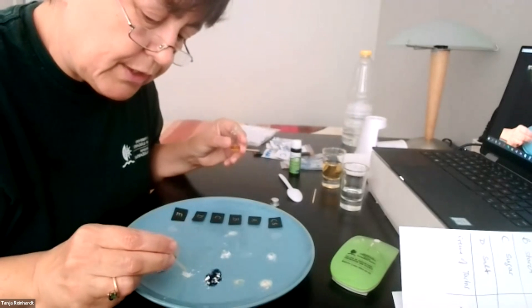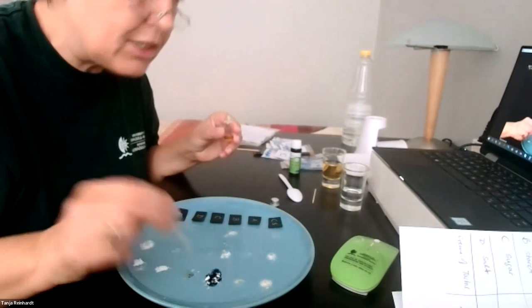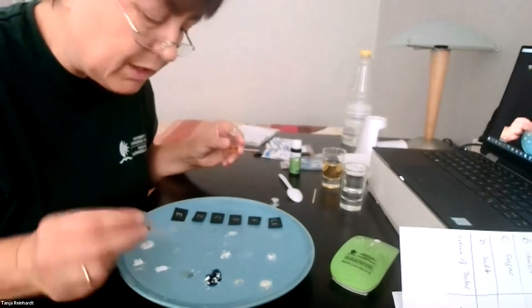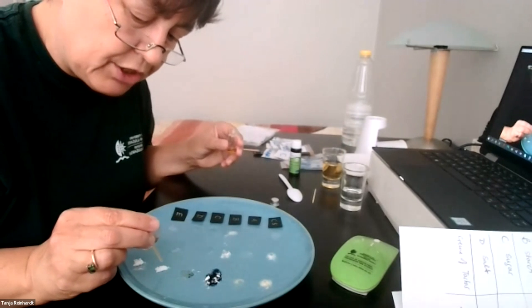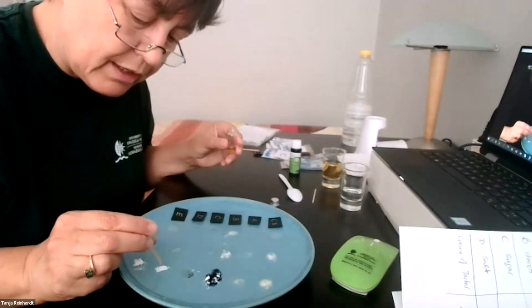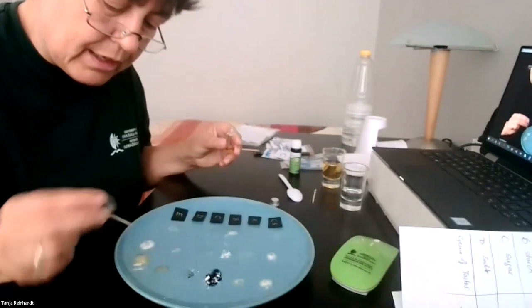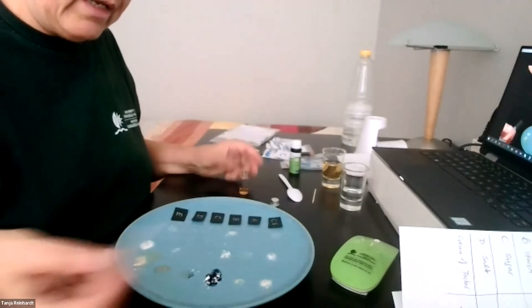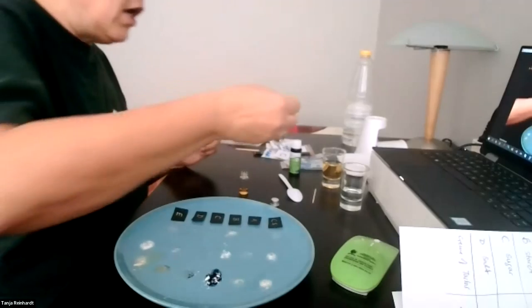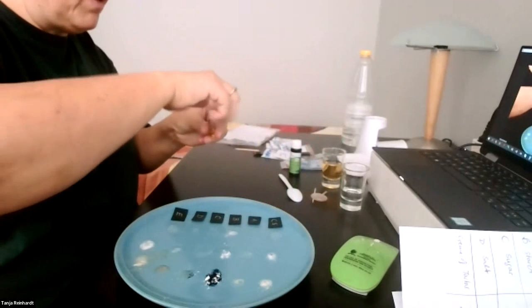And we're gonna go to C. Again, nothing, and this blue color you see here is just a little bit, I think, from contamination from the previous one. Again, nothing, and just this yellowish color again. Okay, so not much happening except for the starch, which turns this nice purple color.